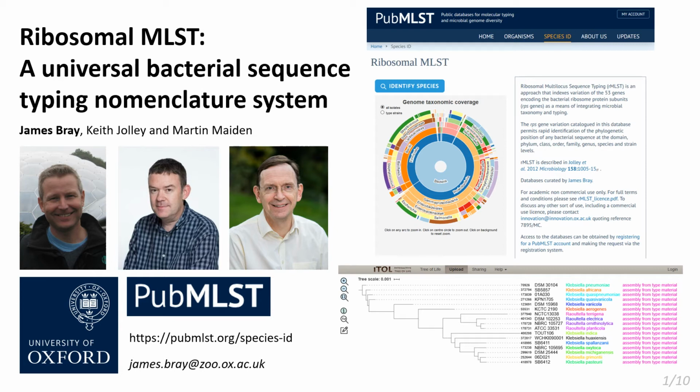In this talk, I'll be describing some of the latest developments regarding ribosomal MLST. rMLST is a universal bacterial sequence typing nomenclature system.